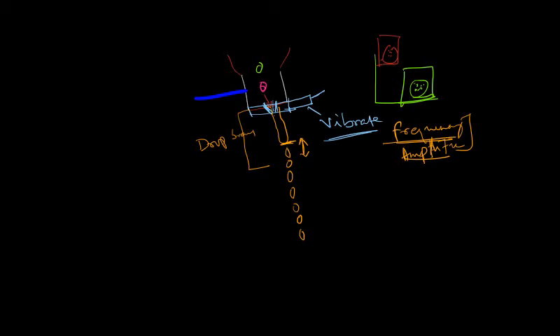So by having a desired break point, what is the advantage? Here, as the cell is getting illuminated and then moves, as long as the stream is continuous, the cell is still in connection with the system. So the cell moves in the system like this.